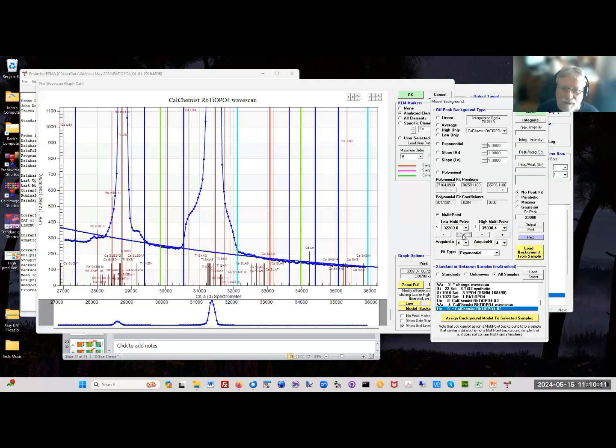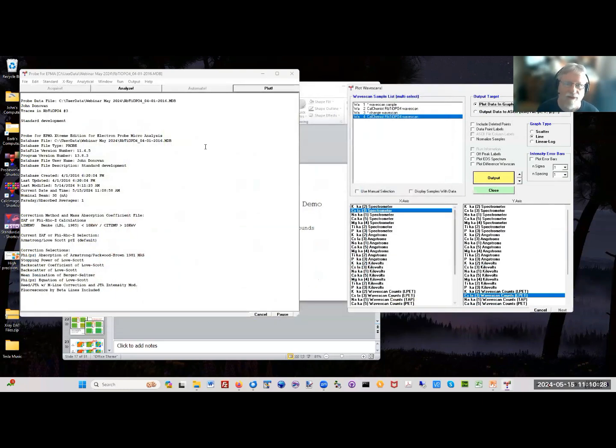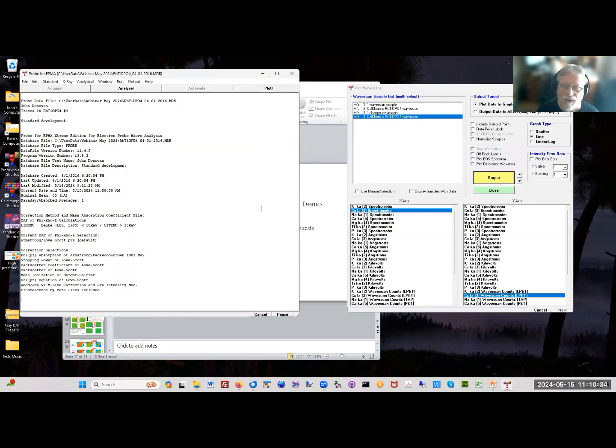Plus. There we go. And so you can kind of bring it right in. And again, you don't have to use all these points. It'd be nice if you could, and if you adjust them carefully, you can get it so you can use them all. But I'll show you what I mean, and you can assign those then to the samples you have offline. But we can also review these things from this window here.